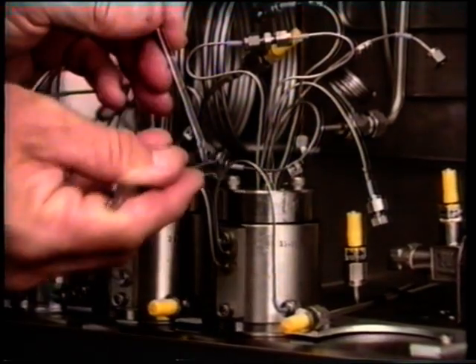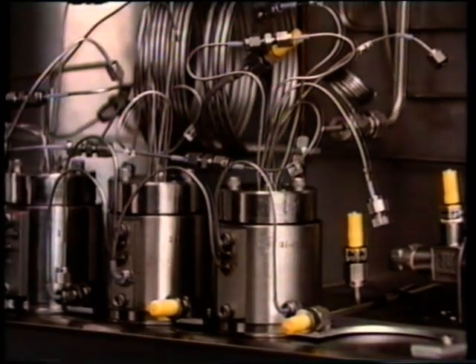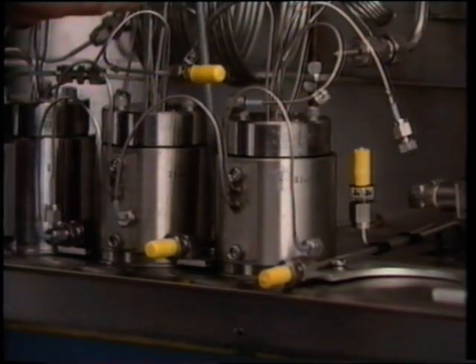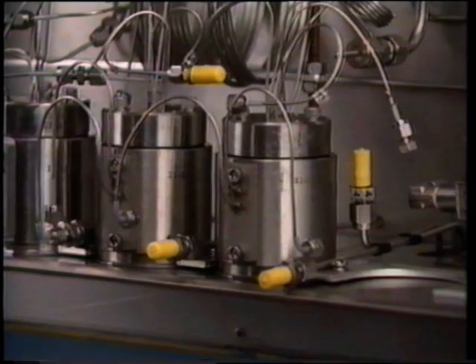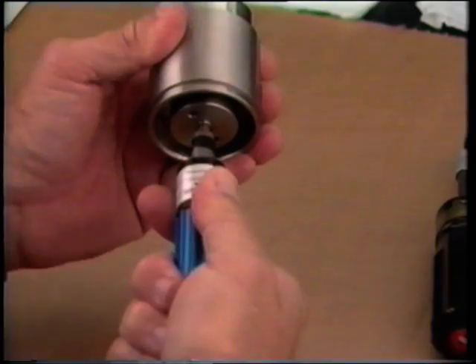To repair the leak, it will be necessary to remove and disassemble the valve. First, disconnect remaining connections to the actuator. Then loosen the valve bracket screws. Slide the valve out of the bracket. Start valve disassembly by separating the cap from the body.